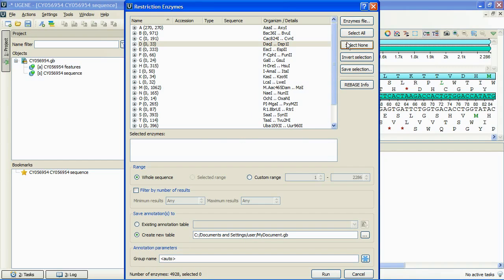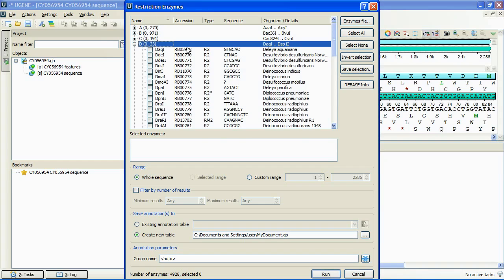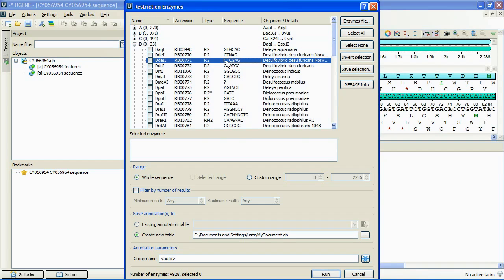If we need more detailed information of the concrete enzyme, we can select the desired enzyme with mouse. Then pressing the Rebase Info button will lead us to opening a rebase web page with detailed information of the enzyme.